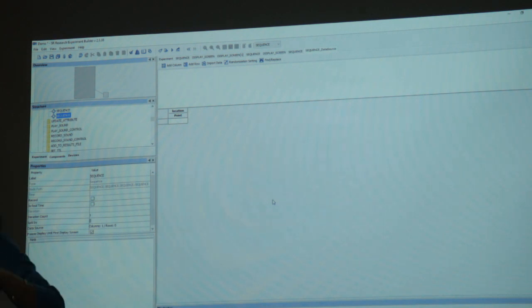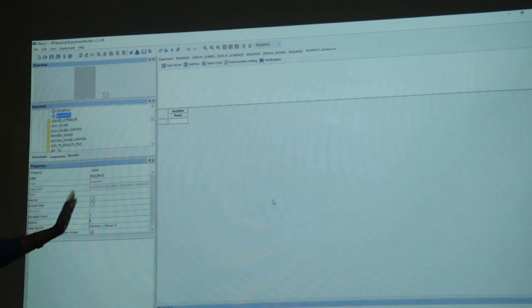So what it does to adapt to a smaller resolution is it will just shrink the window, and the sides will become black. You don't want that. So what you usually do is, if you're anticipating to collect data on another PC and designing on a different PC, design it keeping the data collection PC in mind. Whatever resolution you will be collecting on, you have to use those specifications.